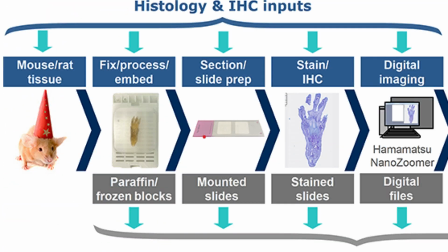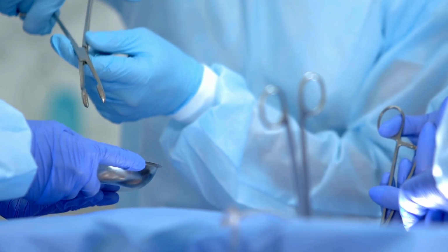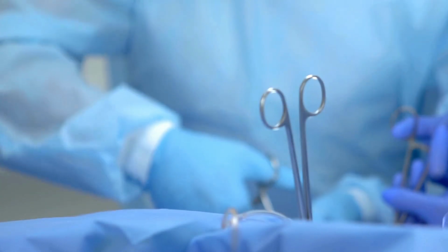Applications. Masson's trichrome is very helpful in the study of scarring, fibrosis, and connective tissue diseases. It is also useful in the study of heart, liver, and kidney diseases as it facilitates easier discrimination between the muscle fibers and collagen in histological sections.